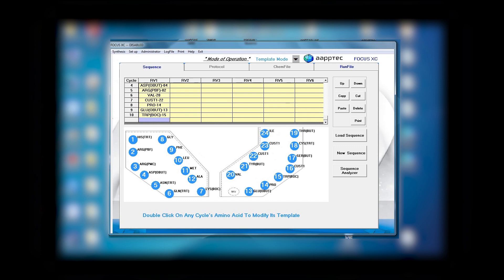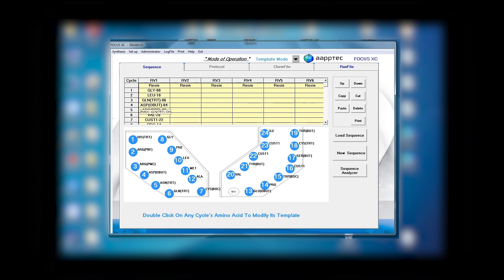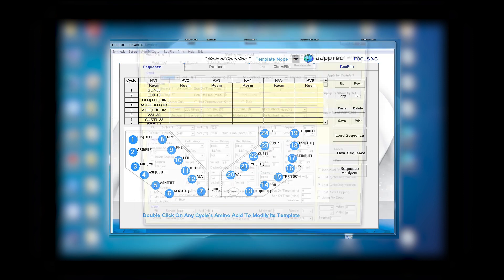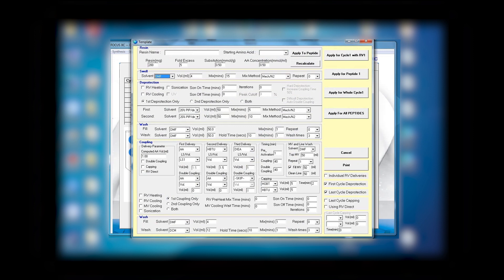Now one can analyze the sequence to see how difficult it is, and this can be done very easily. But first let's complete the information. For an amino acid, double click an amino acid to view a pop-up window for its information.